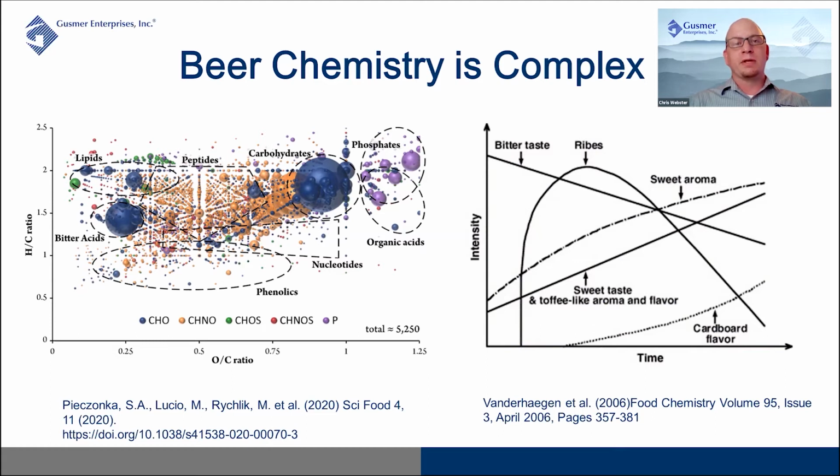So you can use ORP, not necessarily to measure those individual points, but to monitor the overall chemistry of what's going on in your system, in your fermenter for your brewery, or even in your seltzery. By monitoring the ORP, we can improve the potential shelf stability of product.